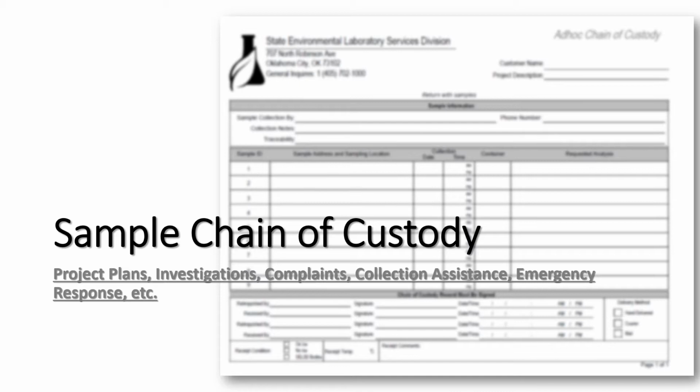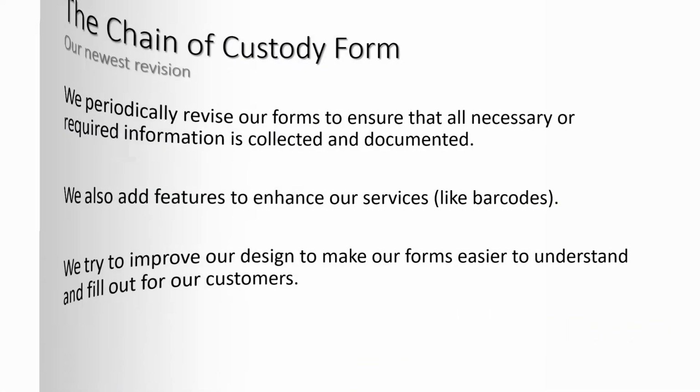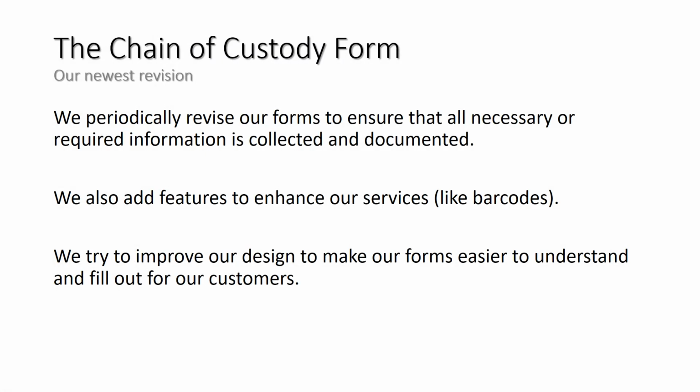The ad hoc COC can be printed and used at any time. We have copies available in the laboratory, or one can be printed from our website. When possible, the lab will provide pre-logged sample paperwork. Here are a few reasons that we have updated our previous form: to collect new, required information, added features, and design improvements.